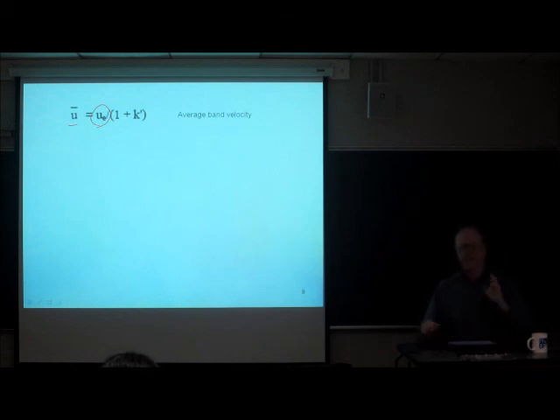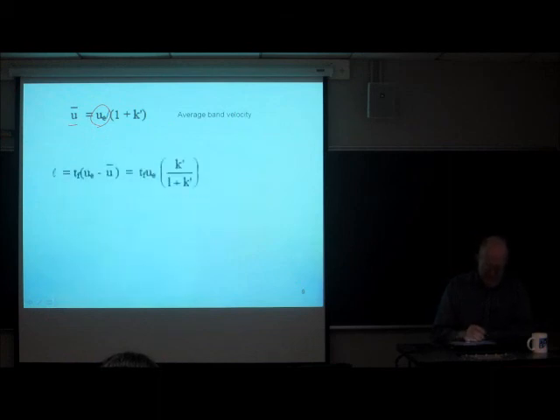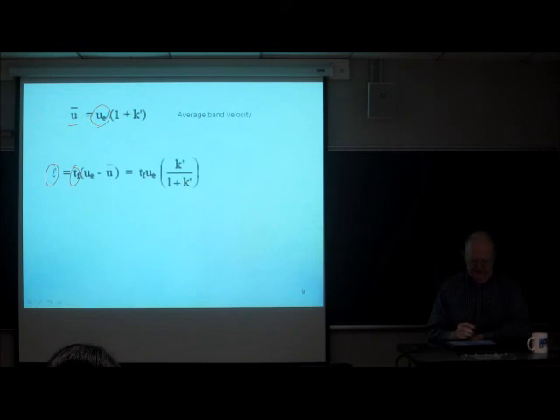Now, how big of a step forward does a molecule make when it's in the moving phase? Well, it's a step forward relative to the average position of the other molecules. So the step is TF, the time in the mobile phase, times the difference between the velocity when it's in the mobile phase and the average zone velocity.